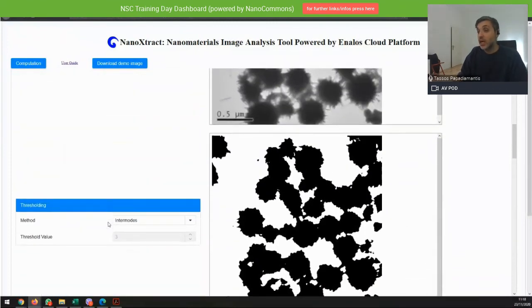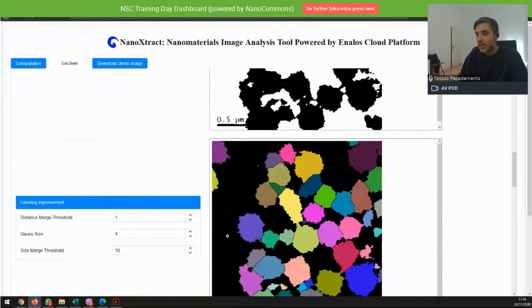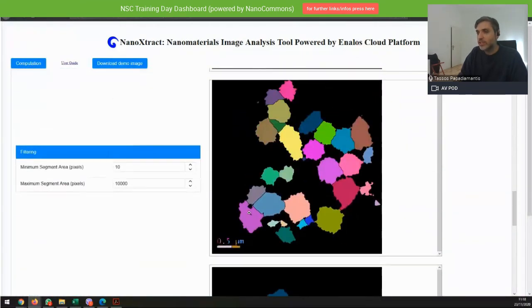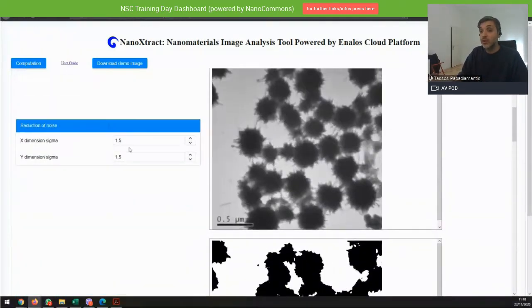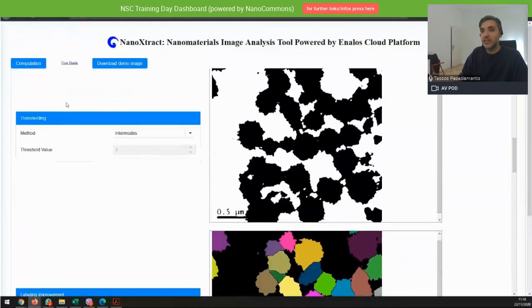complex shapes. Another thing I want to point out, as you will see here, we have some small dots that you can see are being transferred here and so on. So these things can affect our results. So what I'm going to do is increase the blurring slightly so that these small artifacts that you can see are removed. So again, keep in mind that, and we press computation.